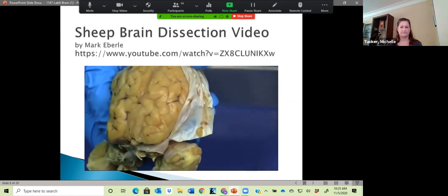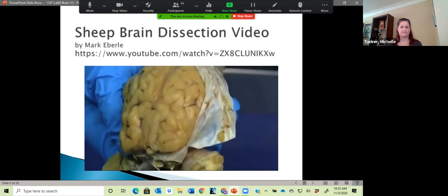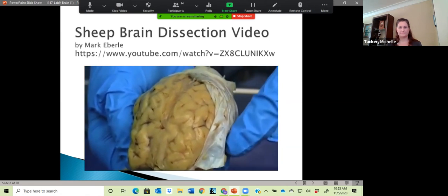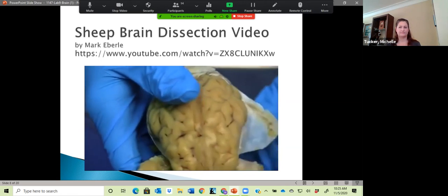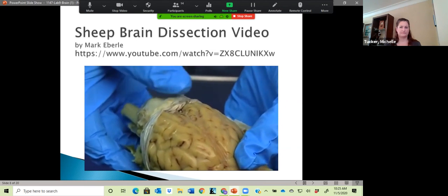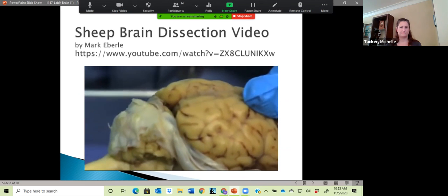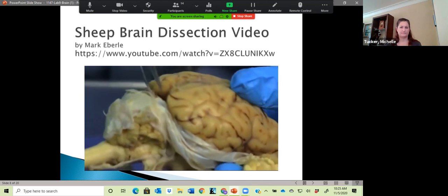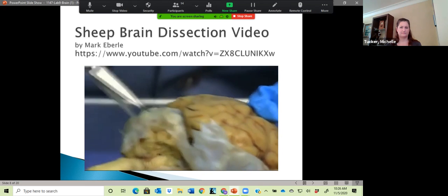That's where the cerebrospinal fluid flows back into after it's floated the brain. It's a vein that's right in the dura mater. I'm just going to keep peeling. Where the cerebrum is next to the cerebellum, the dura mater goes in between. And so I'm going to need to cut that. I'm going to take the scissors and go in like that, cut down.